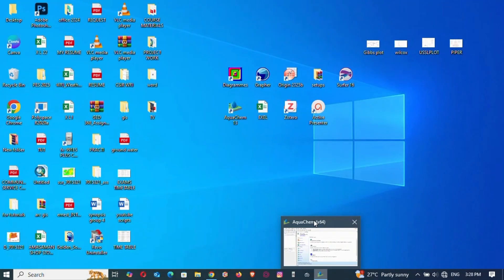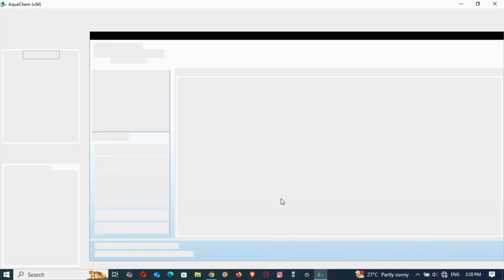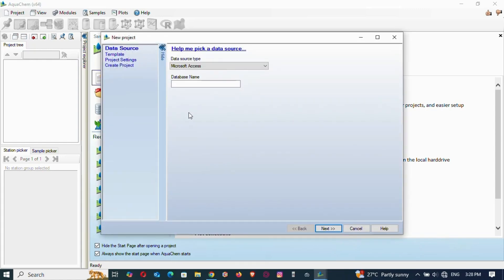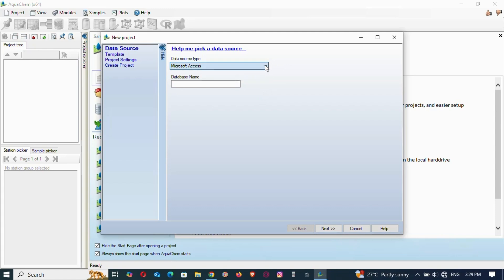First, you come here and open a new project — New Project, Microsoft Access. What you have to do is enter the data in your database and enter a name, any name you want to give to it.